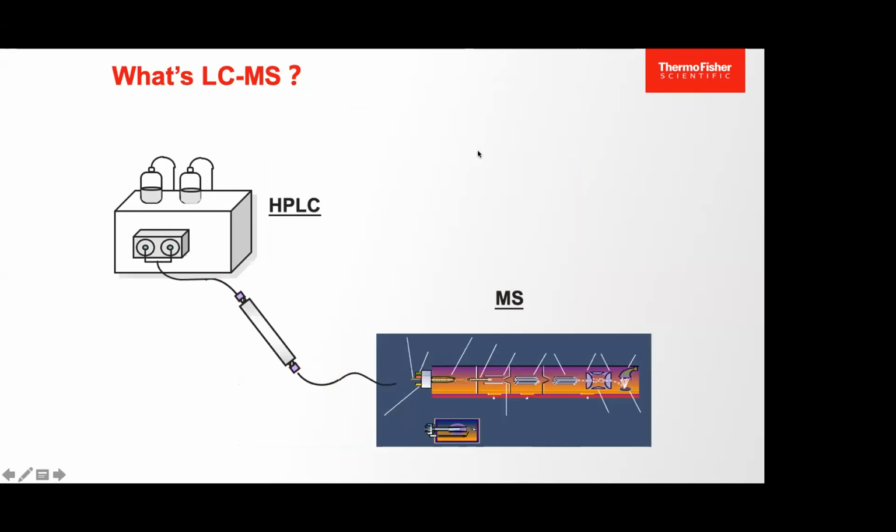So this is the analogy of LCMS. You will need a front-end HPLC system to perform an automated injection. This HPLC system will deliver solvent to pass through the column. So why is the column required? Because it helps us to segregate the compounds by elution time. We call it retention time. With that, you are able to confirm the identity of the compound.